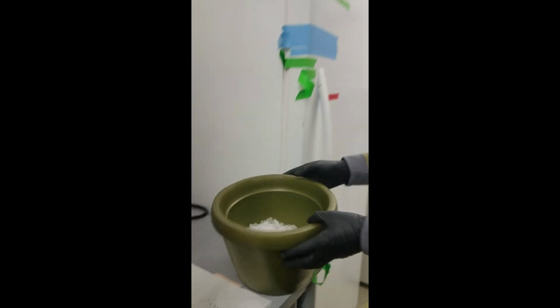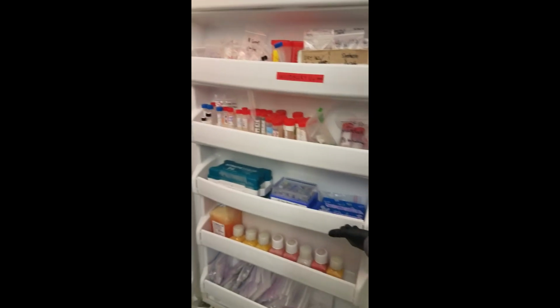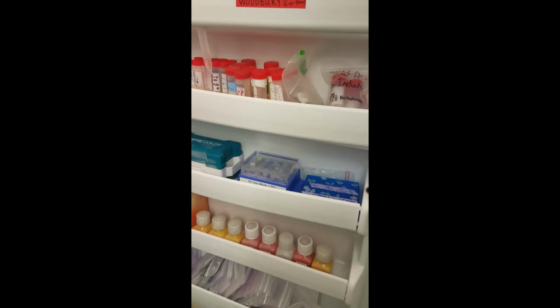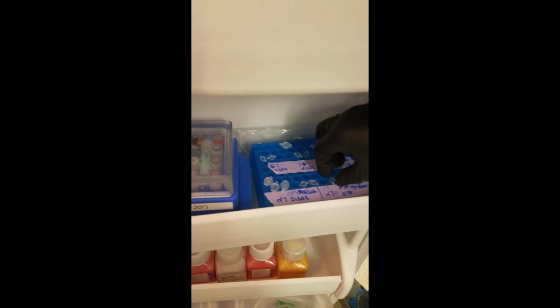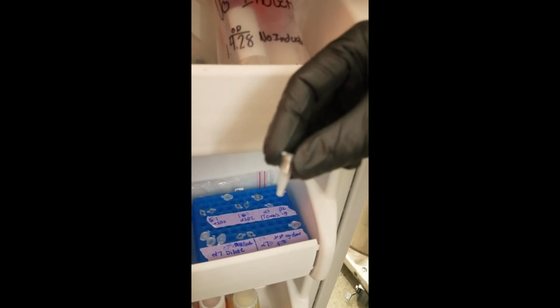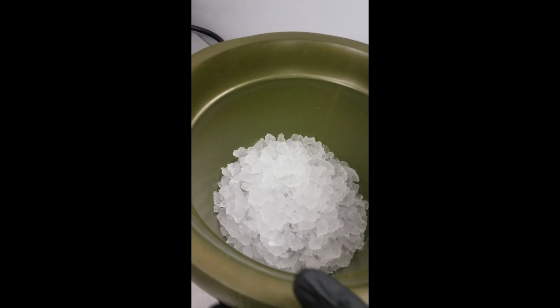And our RNA is stored in this fridge, or refrigerator, it's a freezer. It's in the door right here. This is our tray of RNA. And we have different sections labeled, as well as labels on the caps of all of the tubes. So today we're going to do alpha 7 beta 2. So I've prepared this aliquot of alpha 7 beta 2, and this is what we're going to use. So I'm going to take it out of the freezer, put it in the ice, and then take it back into our room.